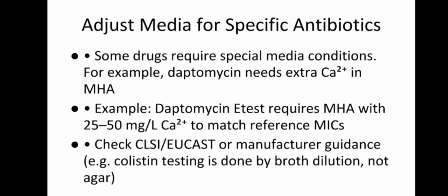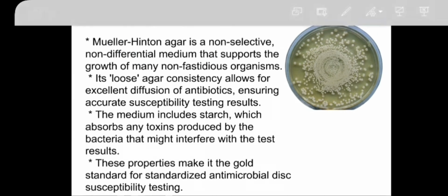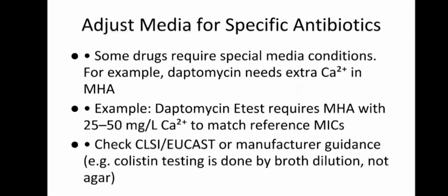Next we have to adjust the media for specific antibiotics. Antibiotics have a lot of classes, and depending upon the mechanism of interaction with the bacterium, whether it is DNA or the cell wall, they are classified, and also by type, whether it is peptide-based or not.